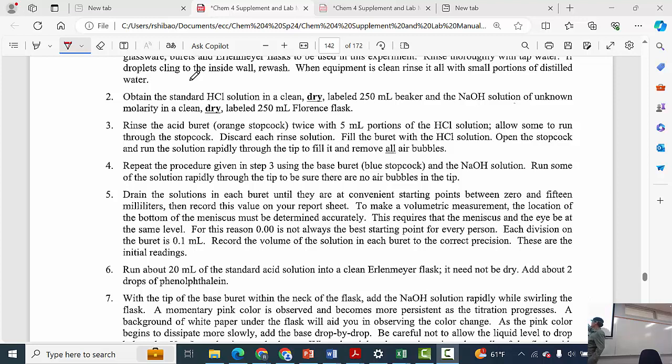That one has a second hand. If the color disappears before 30 seconds are up, then we are not there yet. All right, let's say it's been 30 seconds. Do you see the color persist? But that was with 1 1/4 drop. So what I'm going to do is add 1 drop of acid to undo it. Okay, so I put in 1 drop of acid.